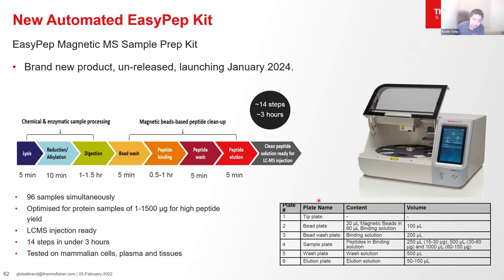You can also add a protein cleanup step like the SP3, right? So you can clean up the proteins, also automate this process, and after that, you just add in the digestion, the reduction, alkylation, digestion solutions afterwards. So KingFisher is a partially automated process, but it's at a much more affordable cost. This is a very affordable instrument, and it saves a lot of time if you want to automate the sample prep process.